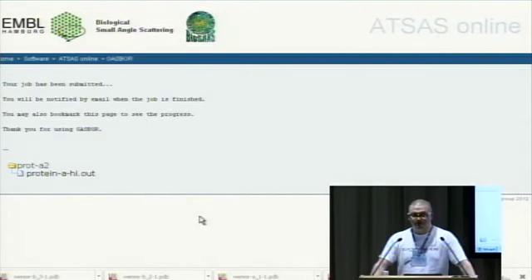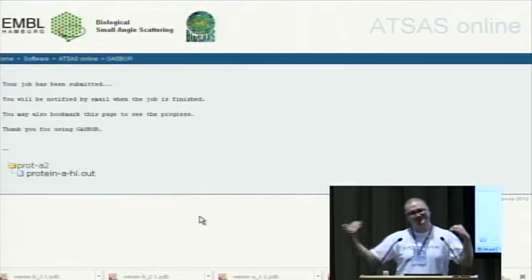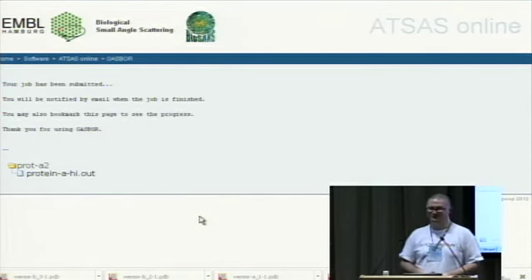Another possible answer to your question would be that something went wrong with the parameters and they just made a very fluffy model and misinterpreted this fluffiness as higher resolution. This is also possible.